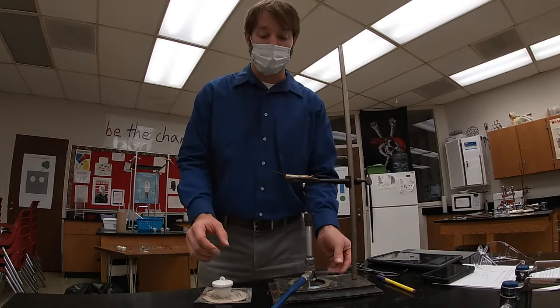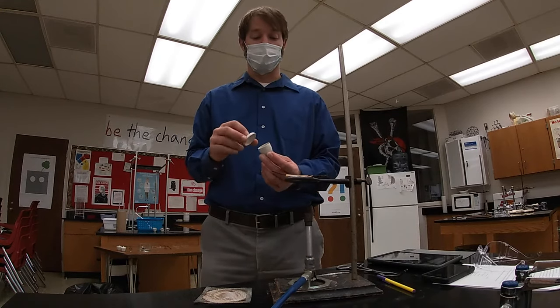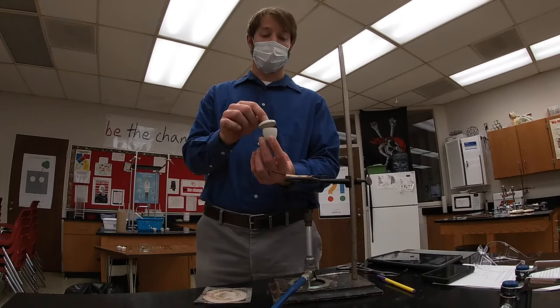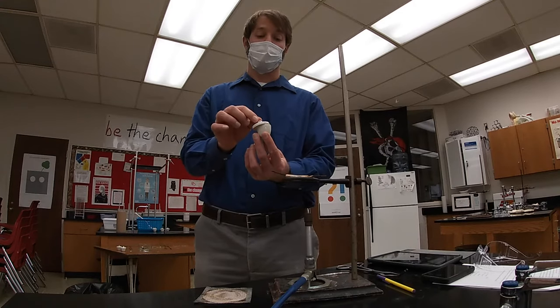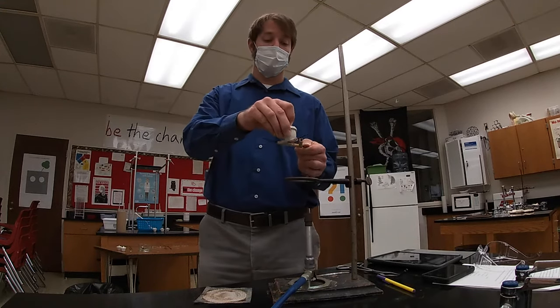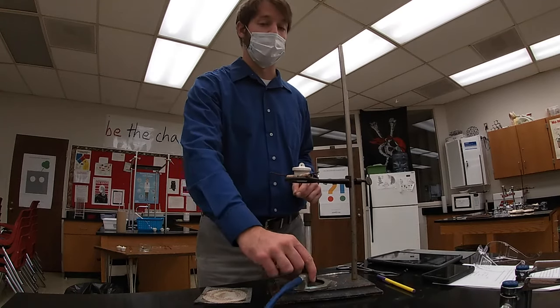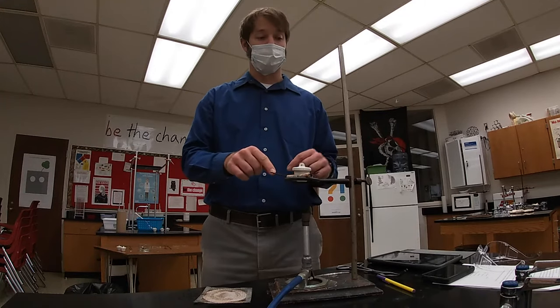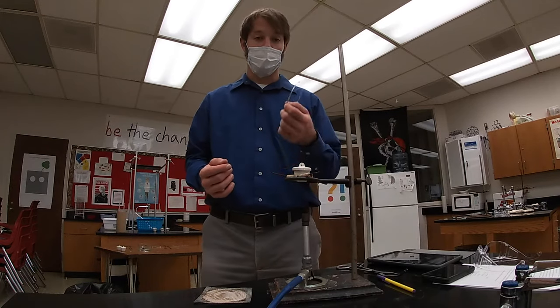We are going to be taking the magnesium metal and placing it in a crucible. This is a crucible — it's made of porcelain. The lid is deliberately bigger than the bottom so that you can have the lid cracked open and still sitting on the bottom of the crucible. We will be placing it in a clay triangle and then on a ring, which is on a ring stand, and we can heat it from below. By using a clay triangle and porcelain as well as metal, we can heat this extremely hot.